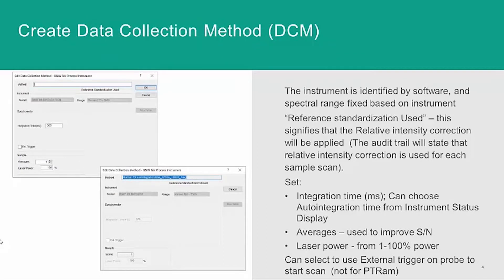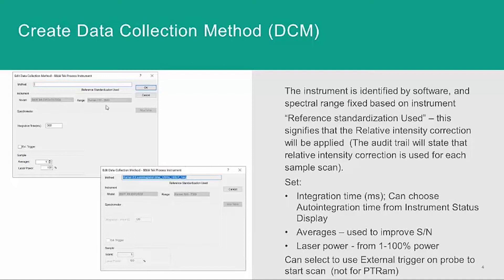The DCM self-identifies based on the instrument, and the model and the spectral range for the instrument cannot be changed in the DCM. Once a DCM has data saved to it, it cannot be modified.